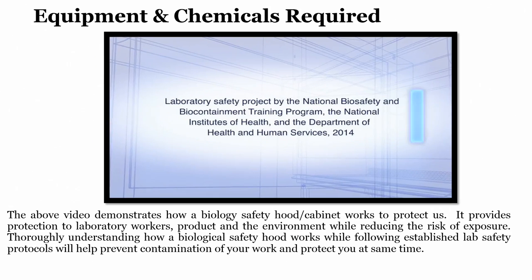Let us see. This video that I will play now demonstrates how a biological safety hood cabinet works to protect us, and how it is helping the laboratory workers by reducing the risk of exposure. We need to understand the biological safety hood, as when we work in this particular hood, there are lab safety protocols which will help prevent contamination of our work and protect us at the same time. So, it is very important you see this video in detail, and then we will continue to the next slide. So, let me play the video.